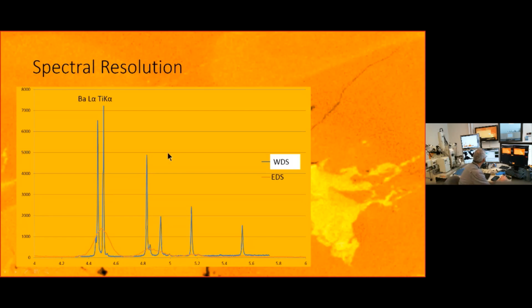One other thing I wanted to show you about this is what we call the peak to background ratio for each of these. For EDS, the height of the peak of this line over the background is quite low compared to the peak to background for these WDS lines. And better peak to background means better detection limits, okay? So detection limits in the probe, if I'm not really concerned too much about detection limits, 500 ppm, 1000 ppm, very doable, not much of a problem at all.